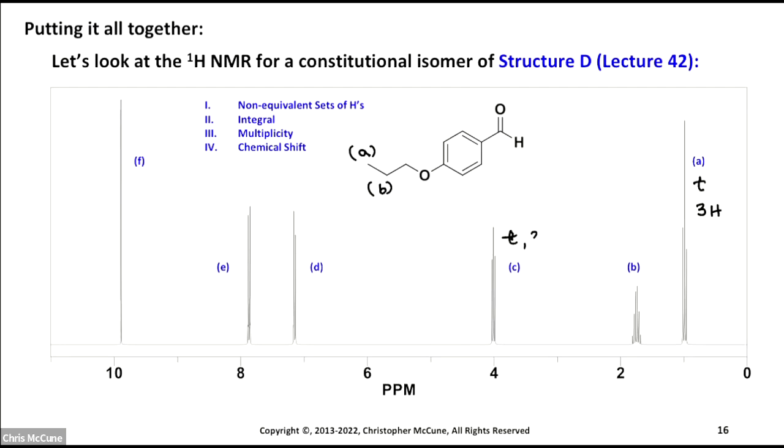And it's going to be 2 hydrogens, most likely the 2 hydrogens that we get on carbon B. Okay. And so why does carbon B have this complex splitting compared to the triplets? It's because carbon B is adjacent on both sides by carbons with hydrogens, 5 hydrogens total. And so we're getting this sextet. And it's integrating to 2 hydrogens. Okay, so you can see these are all kind of related to each other.